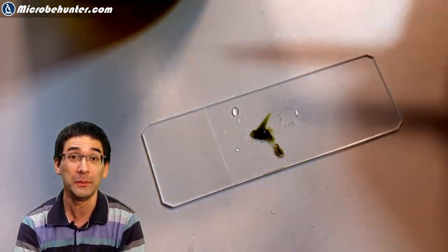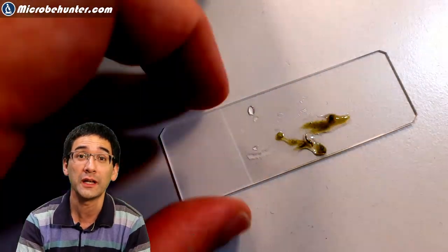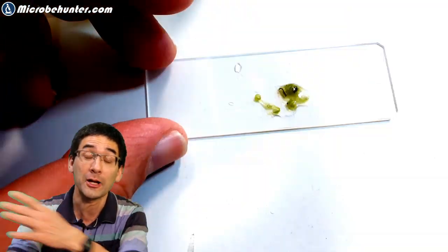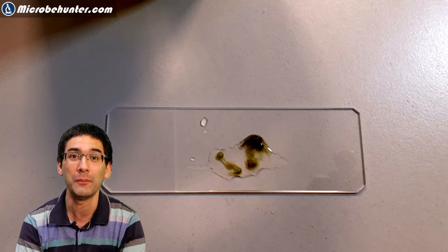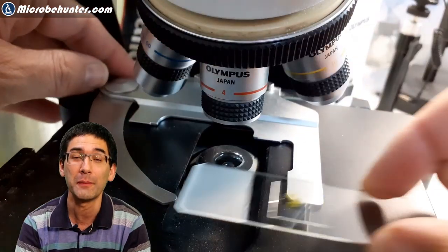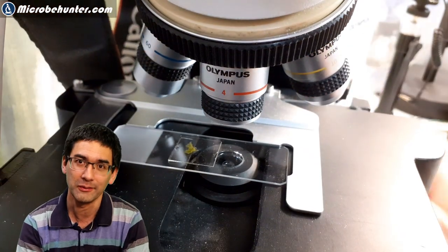In any case, I discovered very quickly that some mosquitoes were already developing. As a matter of fact, around three of them started to develop overnight. One of them actually escaped. I'm going to show you later, towards the end of the video, how I put an adult mosquito under the microscope, which I had to kill first.